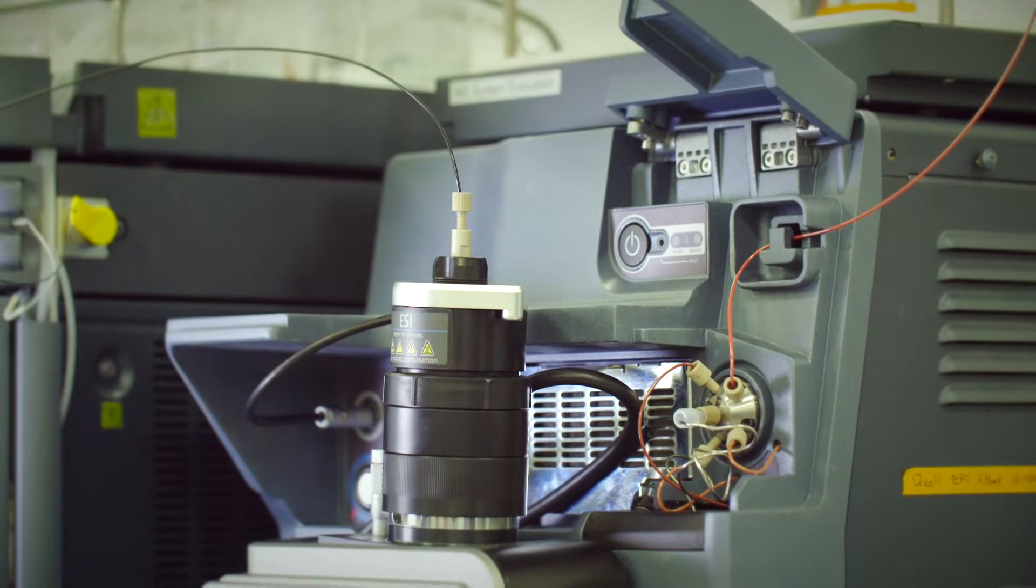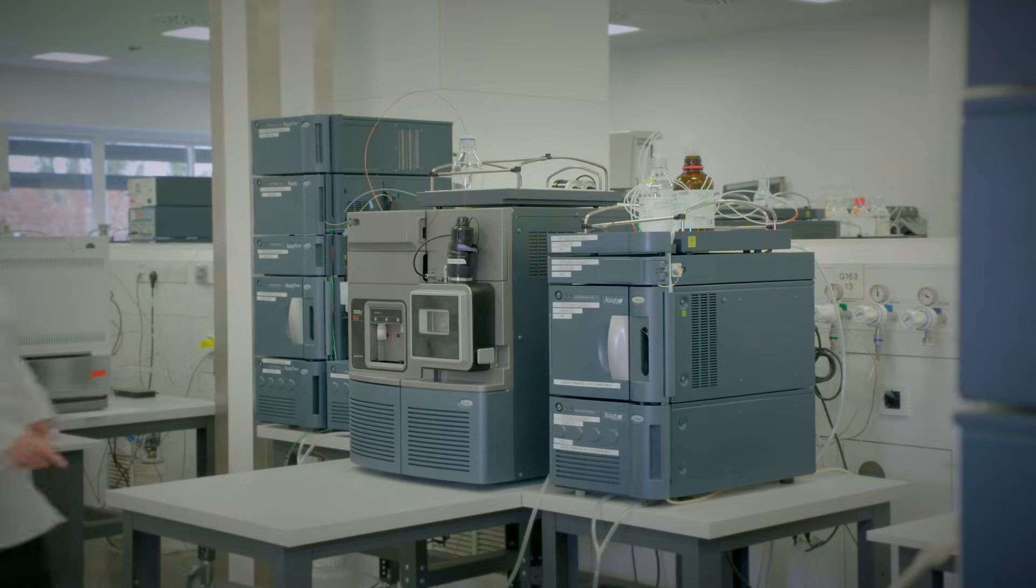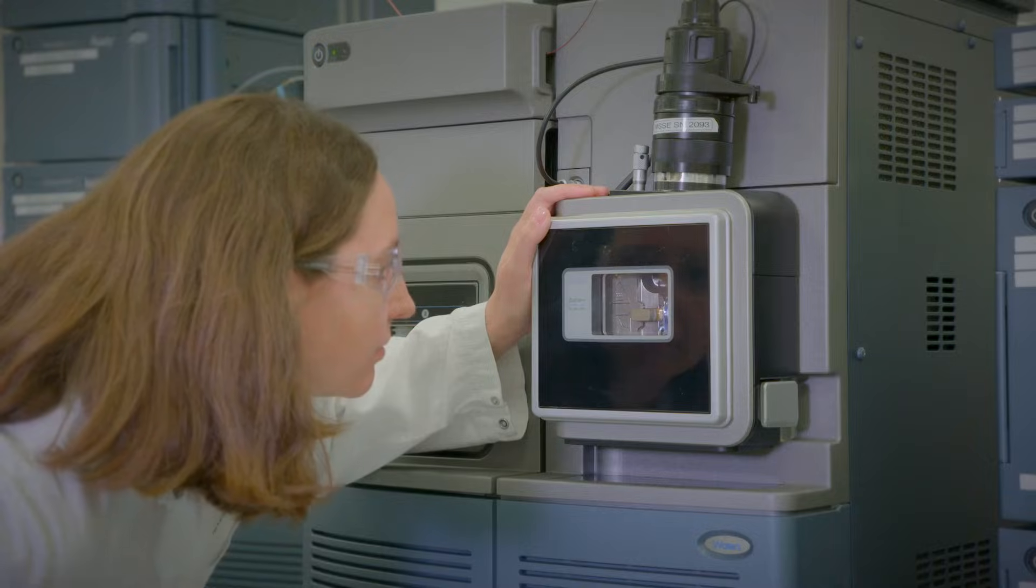In an ESI ion source, a narrow metal capillary is held at high voltage and a potential difference is produced between the capillary and the orifice of the mass spectrometer.